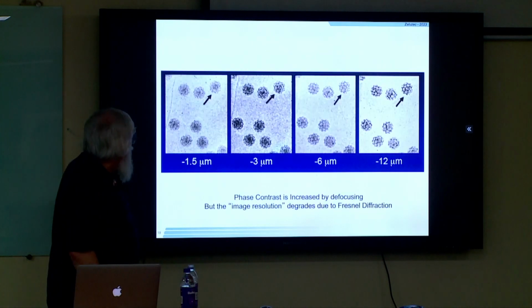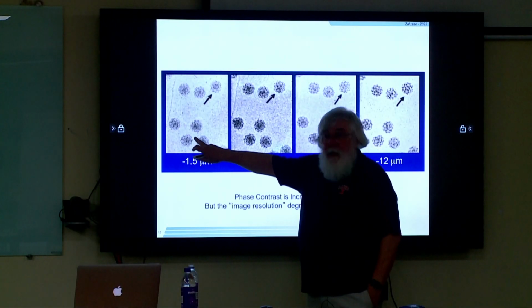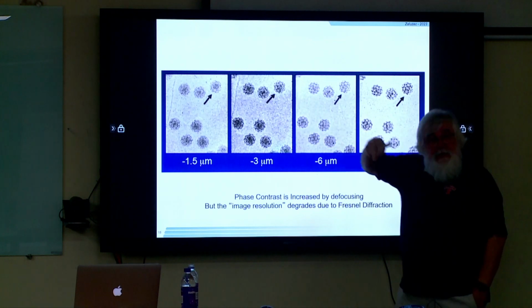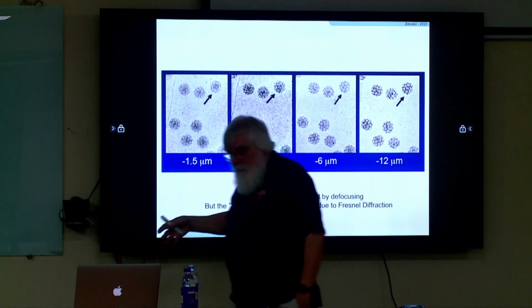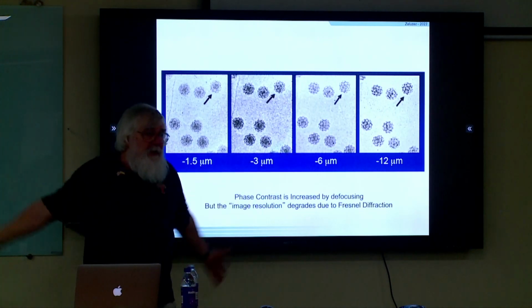Okay? So now, here's the same area of the sample for different values of defocus. What do we see? The contrast for very little defocus is weak. As we increase the defocus, the contrast is increasing. Okay? So everybody says, well, let's just work with a defocused image.